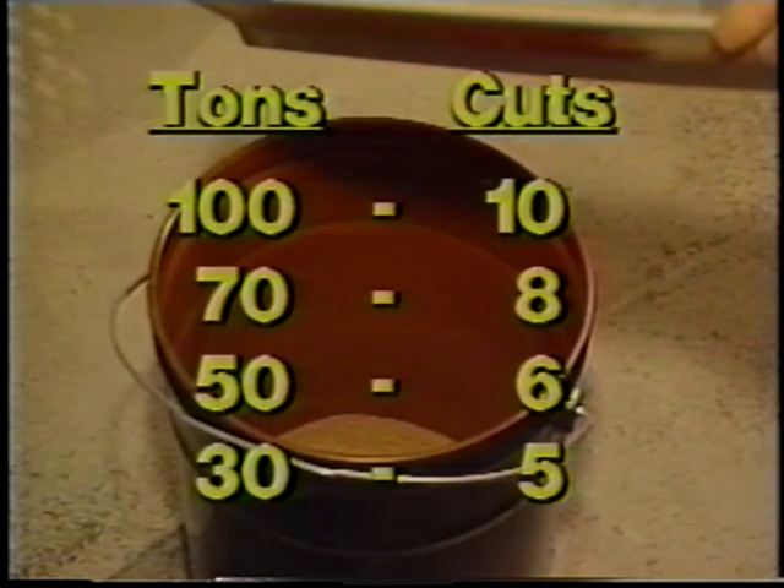For example, with a 100 ton load, you'll need to take 10 full cuts. Also be sure not to sample the first or last 5% of the load, as you will not get an accurate result.